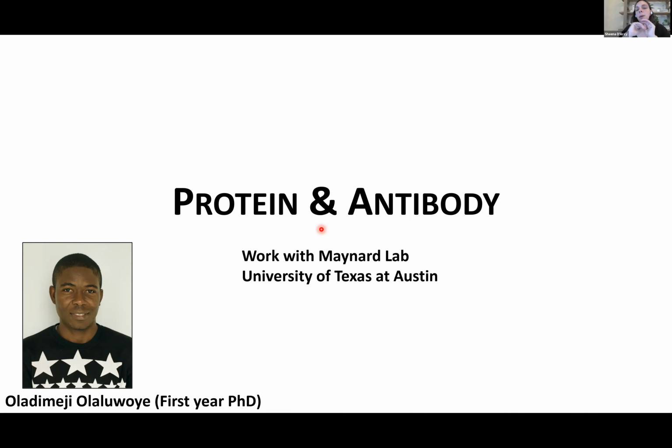bit easier. But then also antibodies have these disulfide bonds, and so you have this added step of making sure you really reduce those disulfide bonds before you put your sample in the mass spectrometer. But again, many have come before us, and there are many protocols and papers available to guide you through doing this. So this is work that we did with the Maynard Lab at UT Austin.